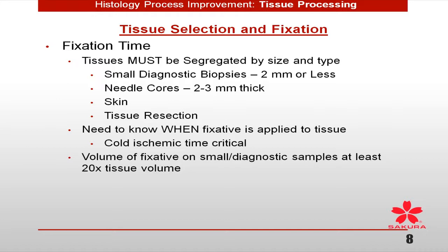You need to know when fixative is applied to your tissue. I hope everybody understands what cold ischemic time is out there. If you're doing breast sampling and you're doing ER, PR, and HER2/neu, what is one of the first things that ASCO-CAP tells you? You must know what that cold ischemic time is. It has to be less than an hour.